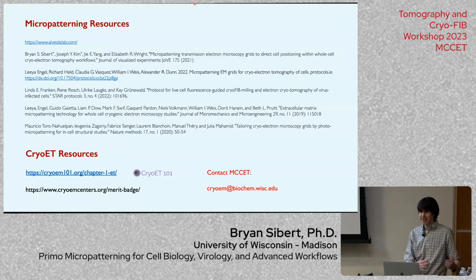Obviously you could get a microscope in a hood, but if I was really concerned about it, I would rinse in ethanol after patterning and keep everything in the hood after that step. Thanks. I thought I'd add to that contamination concern. I've incorporated ethanol washing after micropatterning to all of my neuron preps now, because that is the exact thing that I'm worried about. And it's worked fine.